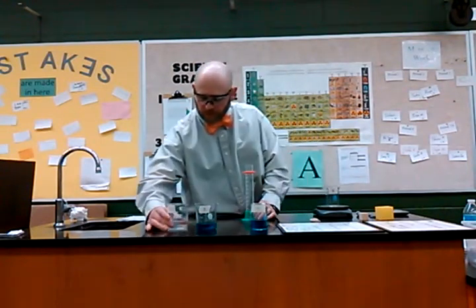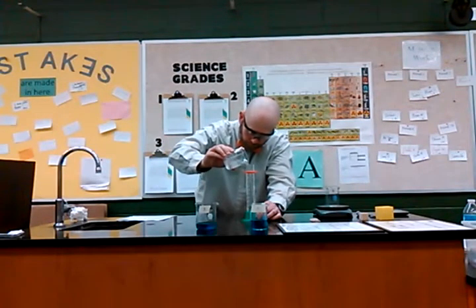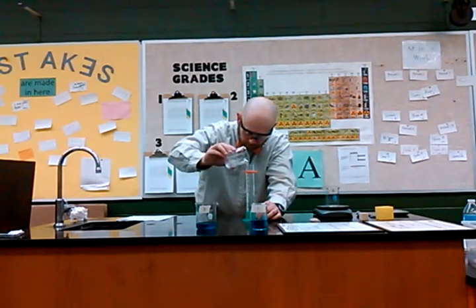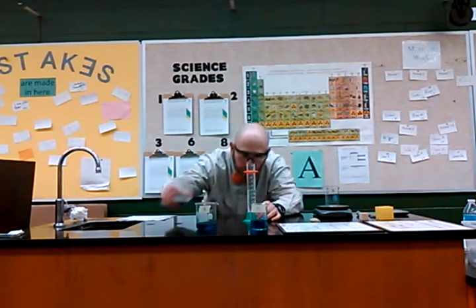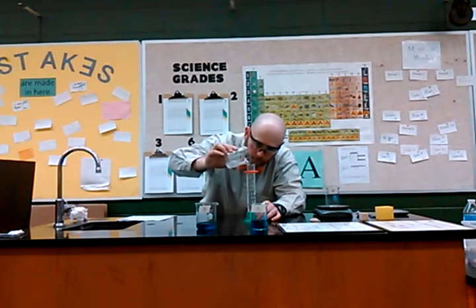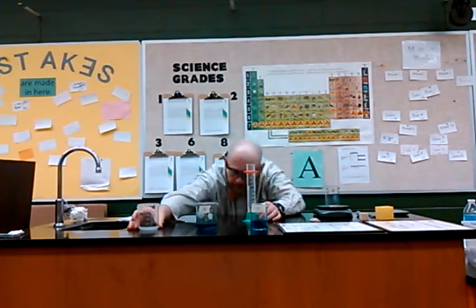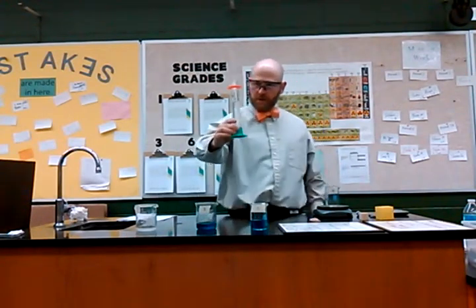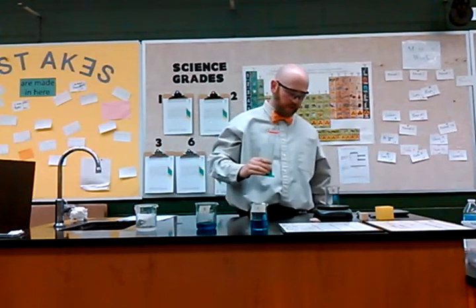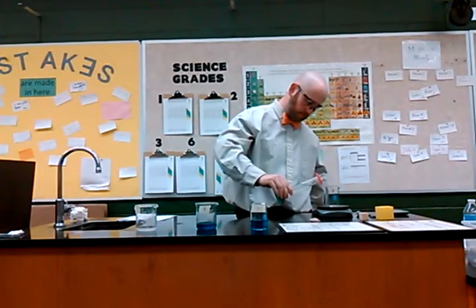In this step, I will pour 80 milliliters of the water and salt mixture into beaker 2. Beaker 2's mass is 64 grams.